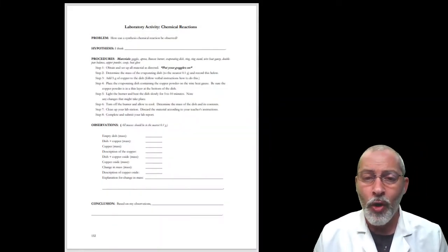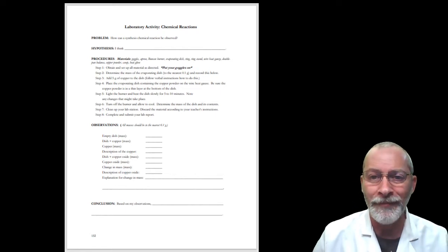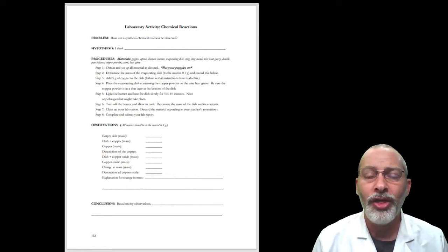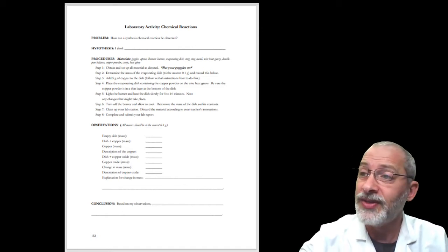Obviously, we're doing this in a video format, a little bit unusual, but let's do the best we can. And I am going to have to provide you some data for you to record. So if you haven't already, open your books to page 132. Page 132 in your books.